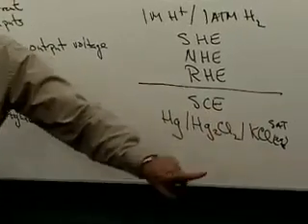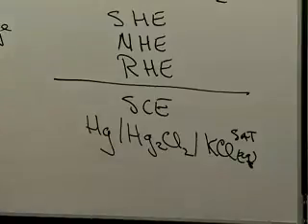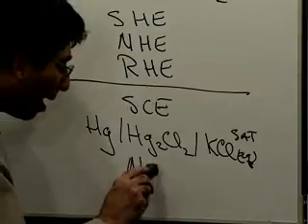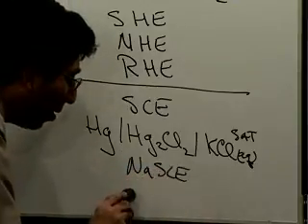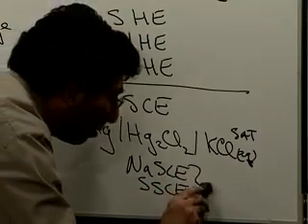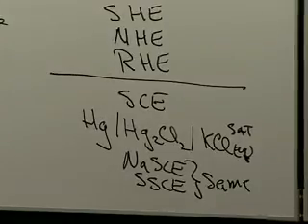But it does turn out there is a slight difference in potential between having sodium chloride there and potassium chloride there. So you will see people talk about either the NaSCE, the sodium SCE, or sometimes the SSCE, same thing. And they've just taken the KCl out and put in saturated sodium chloride in place of that. There's a shift of a few tens of millivolts when you do that.